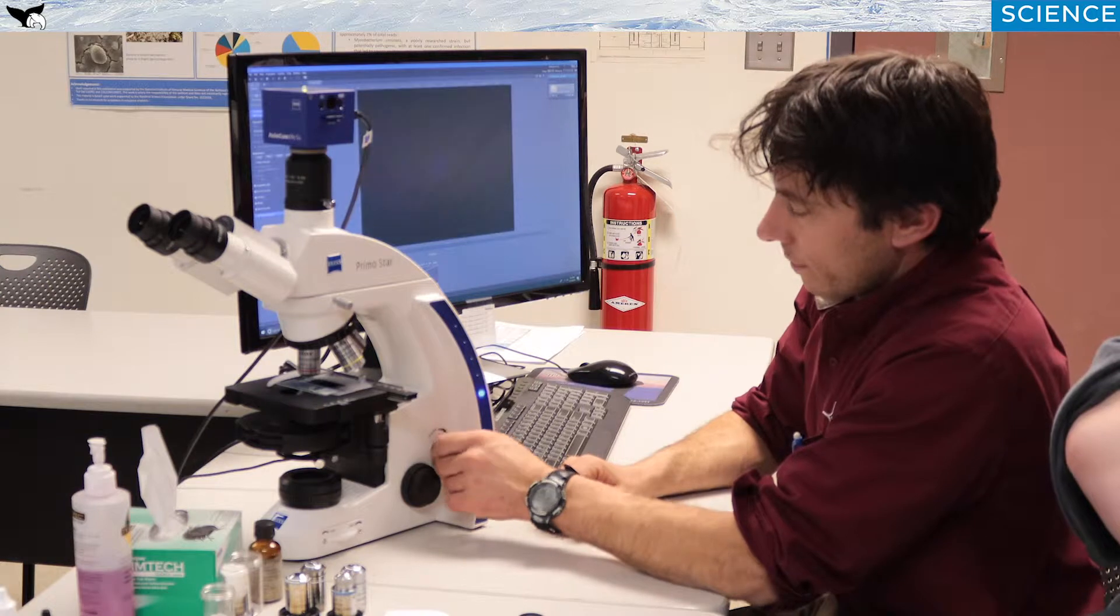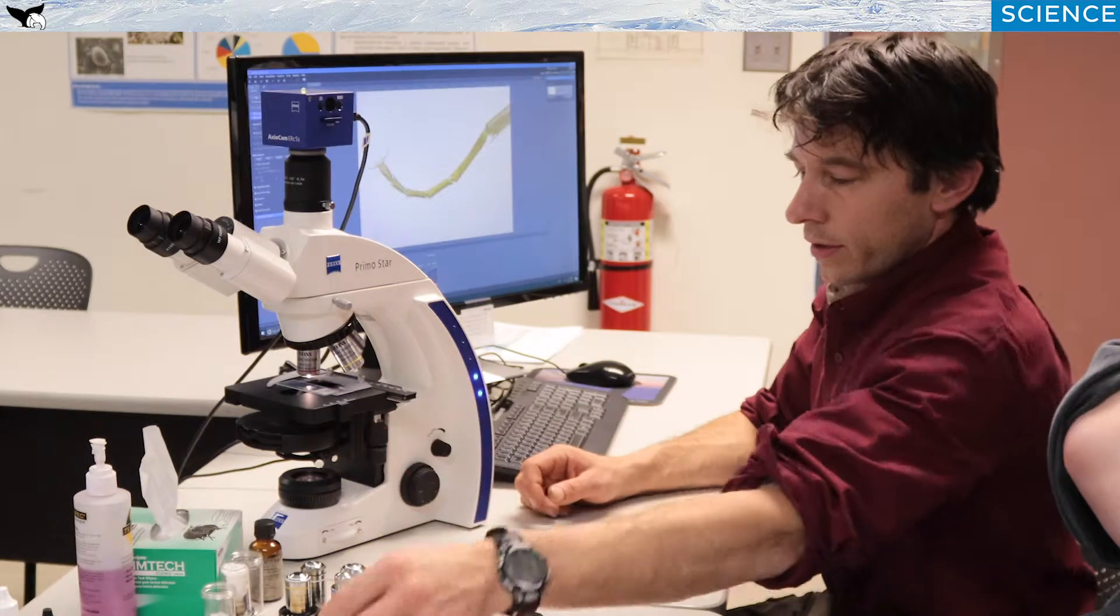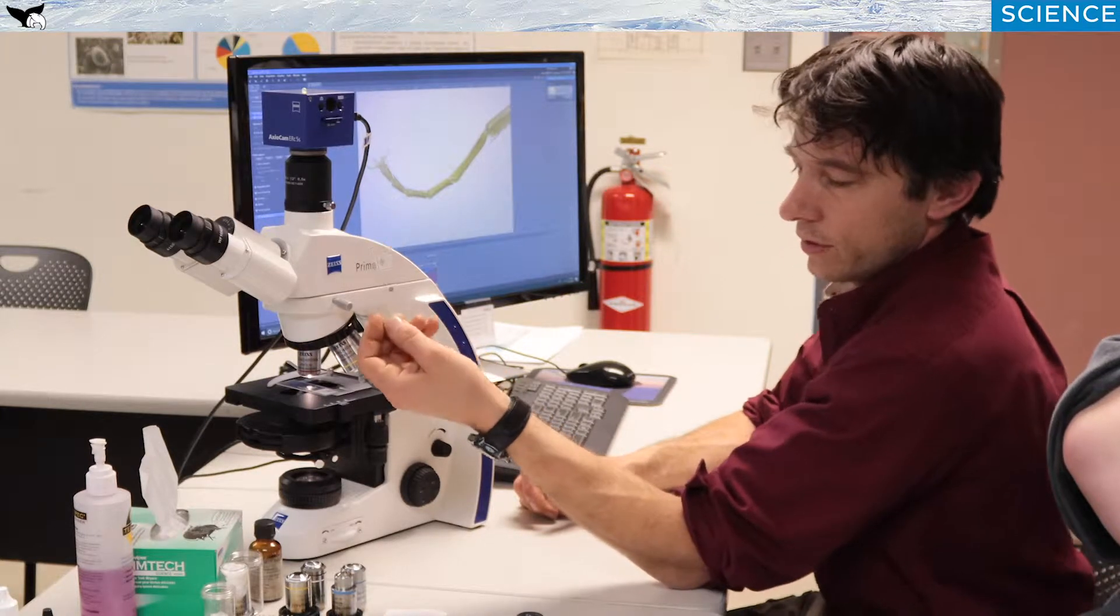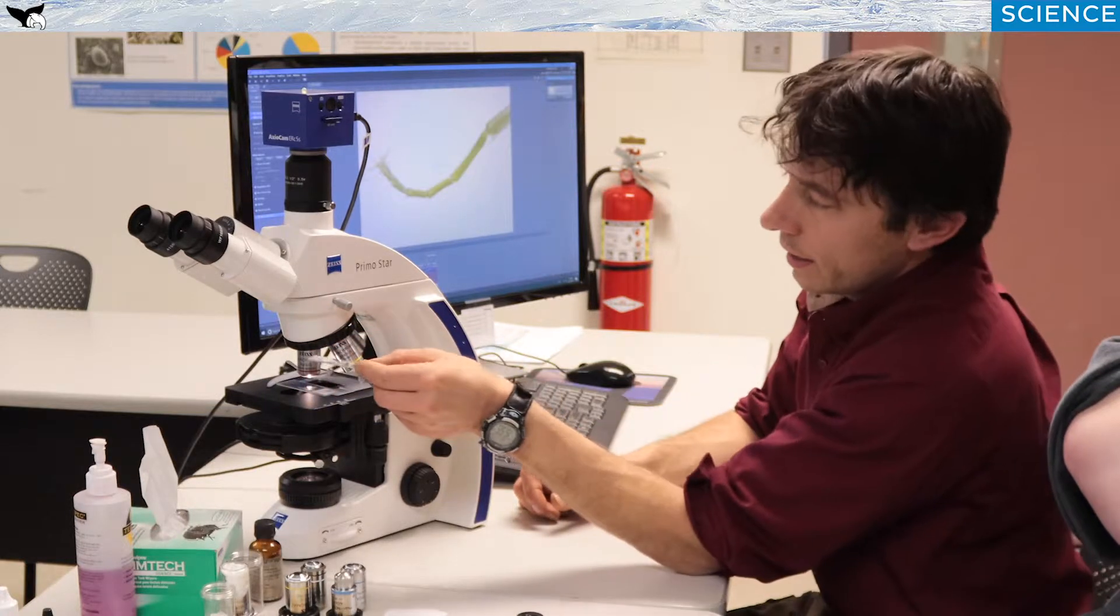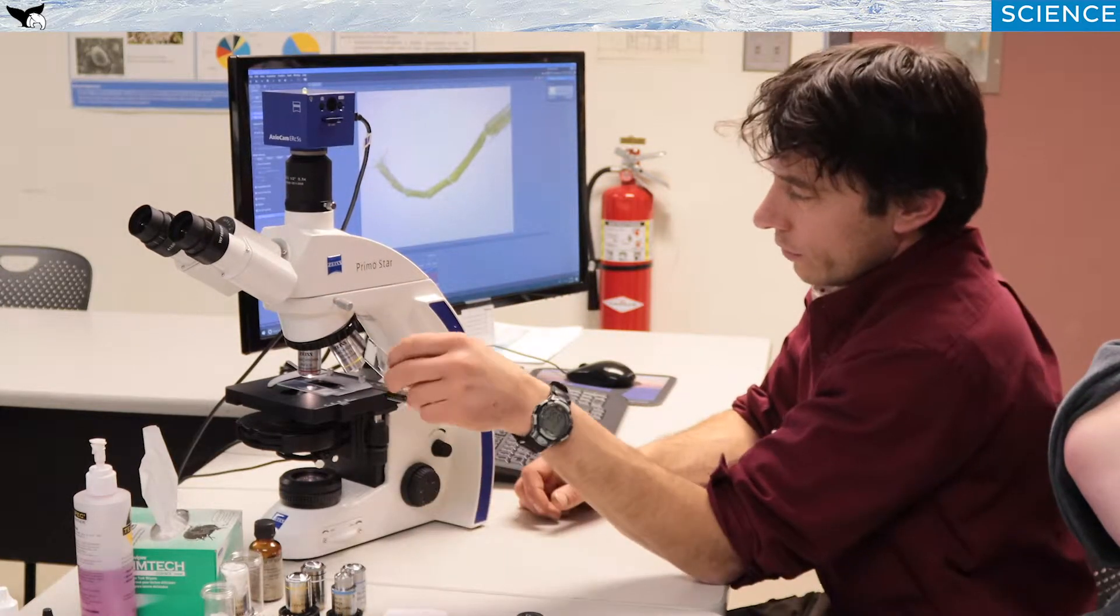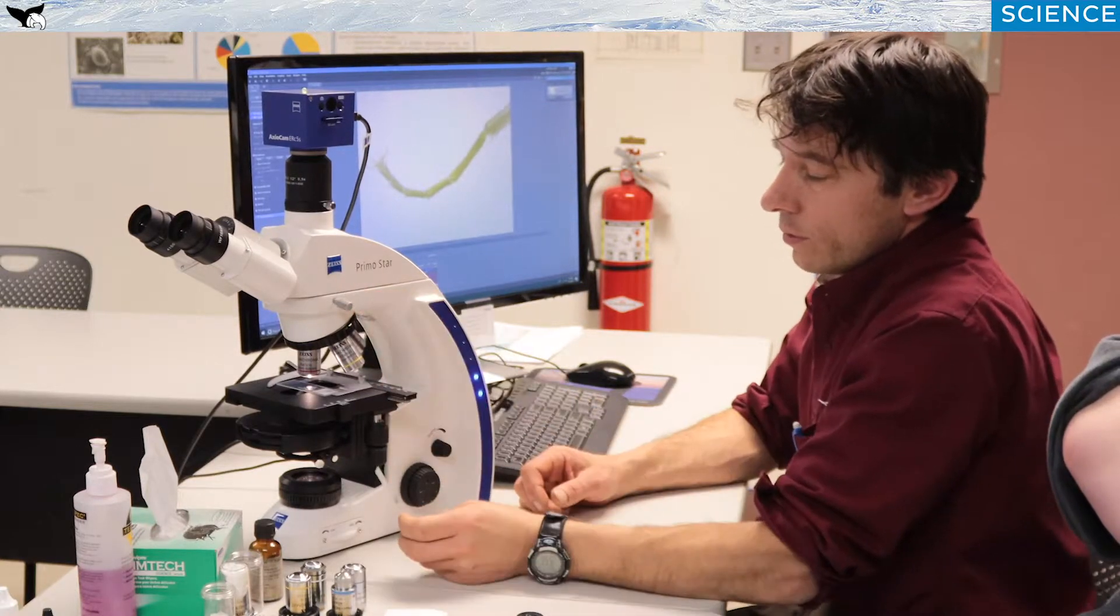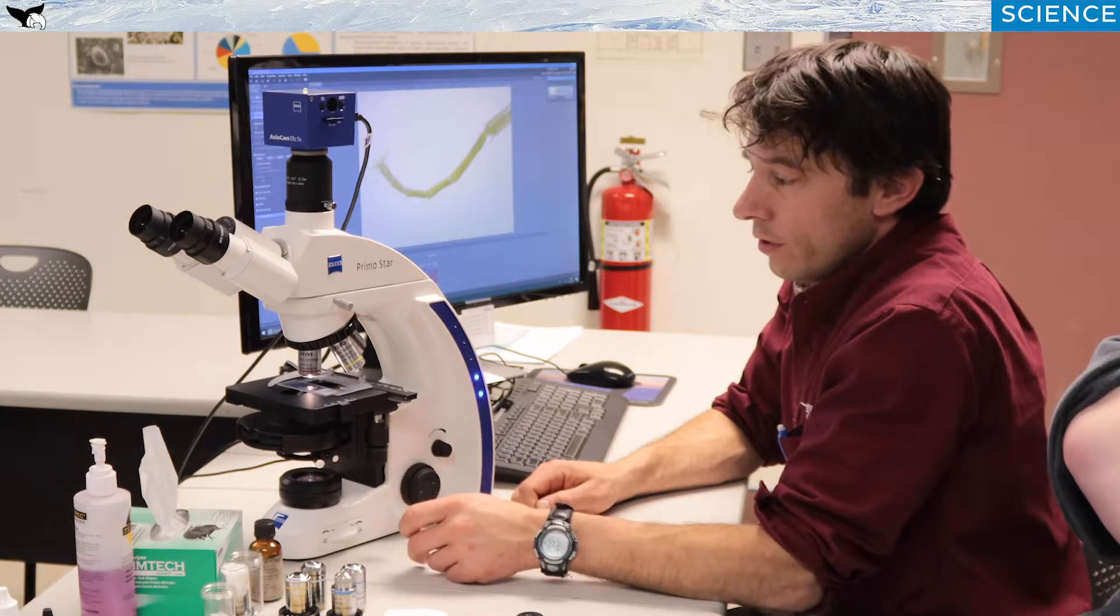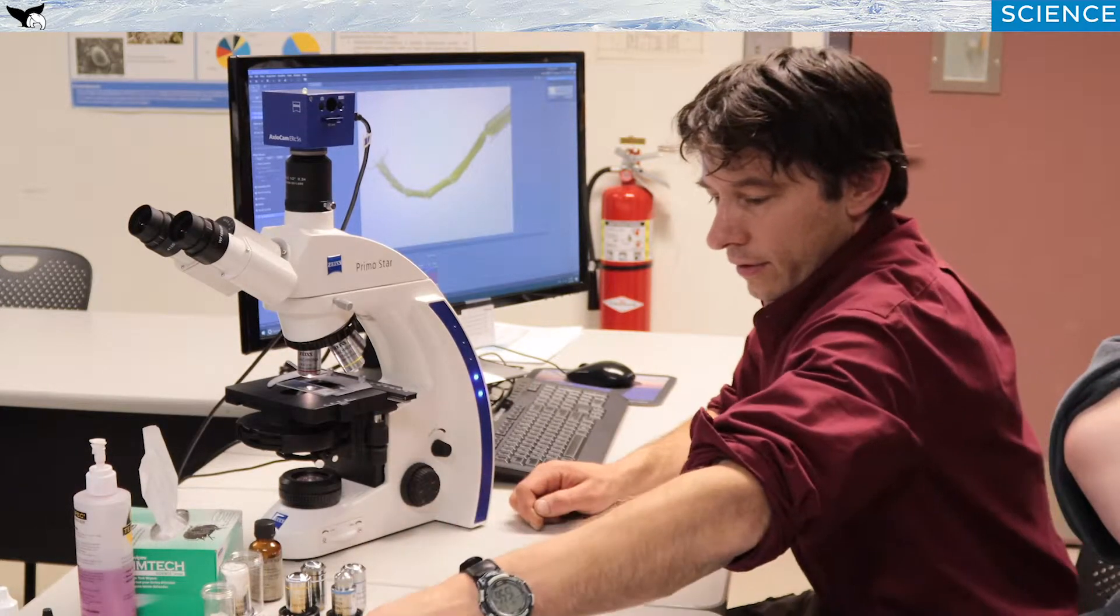Basic microscopes have light come from the bottom, go up through a specimen that is mounted very thin in a thin section on a slide with a cover slip, and put in between the light volume coming up, and then magnify by an objective, and up through your eyepieces. And along the way, there's a lot of conditioning that's done to this light, and magnifying that's done to this light, which I'll explain. Those are critical areas to keep clean, and also critical areas to know how to manipulate certain things on the microscope to get a good image. So we'll go over that as we move along.